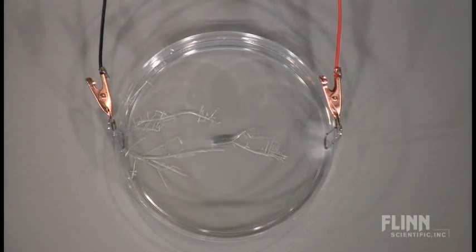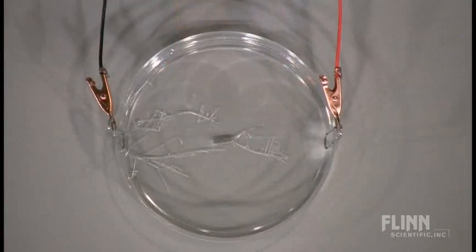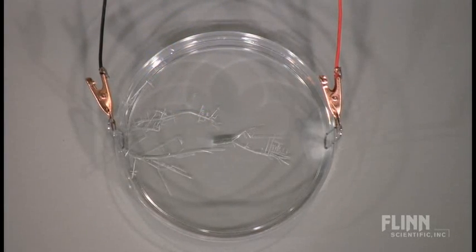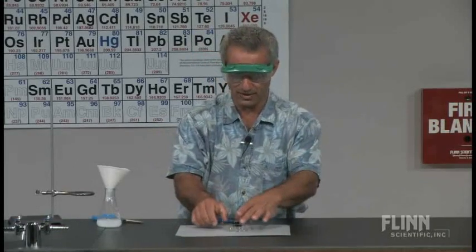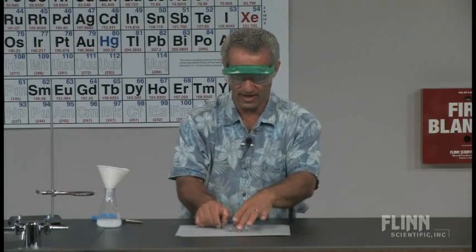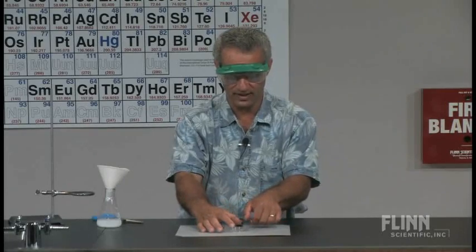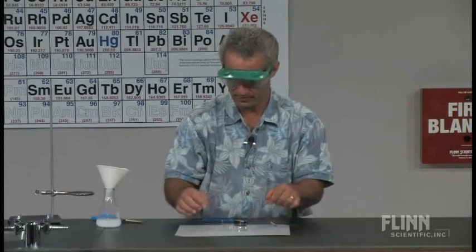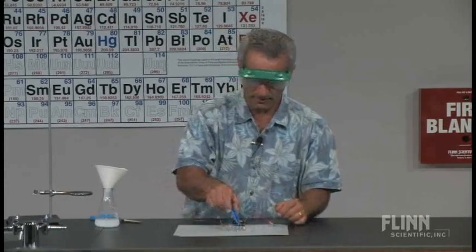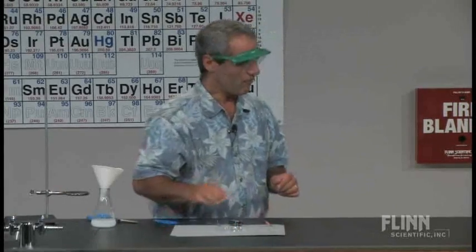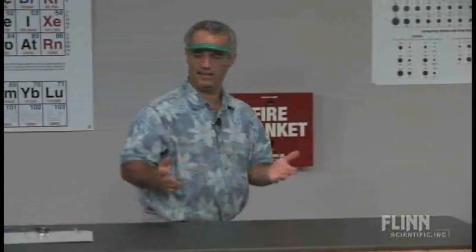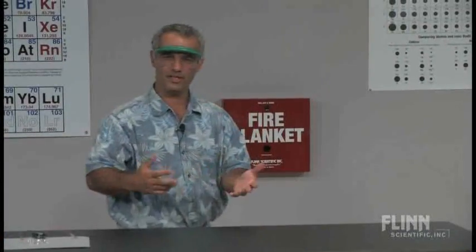And now you can definitely see this flood of white — the white precipitate forming on this side. Beautiful demonstration. I'll disconnect this now, because that's the effect of it. What exactly is happening? Why the tin crystals on one side? What's going on at the other?